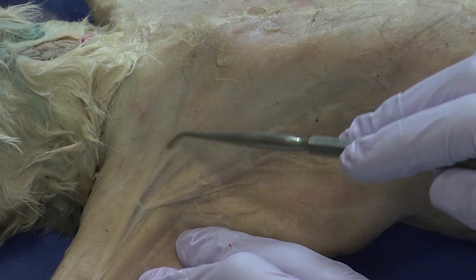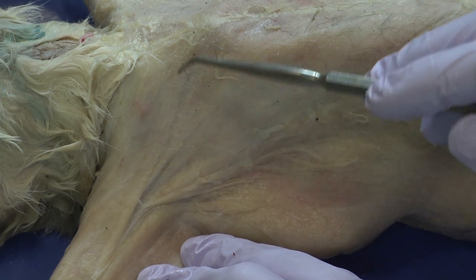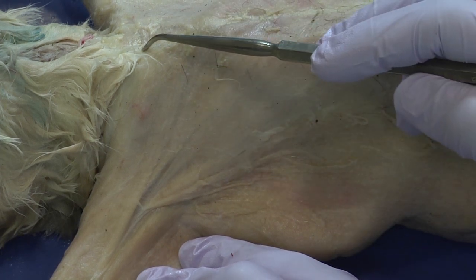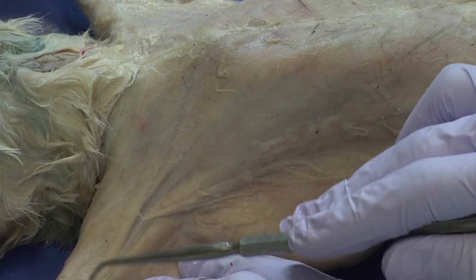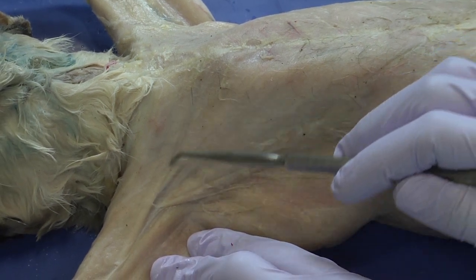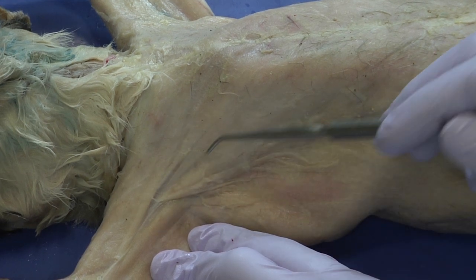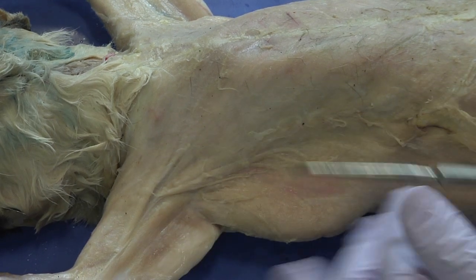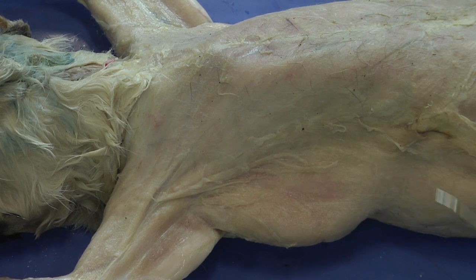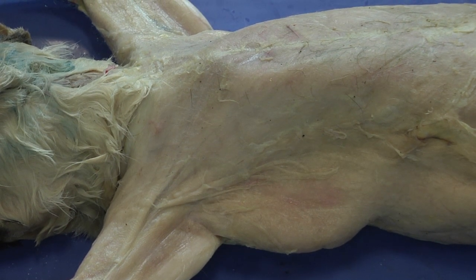This boundary is where we want to make our cut. We never want to cut along the point of origin or insertion — it's always along the side of the muscle, parallel to the orientation of those fibers. I'm going to take my scalpel now, being careful because these are very sharp.